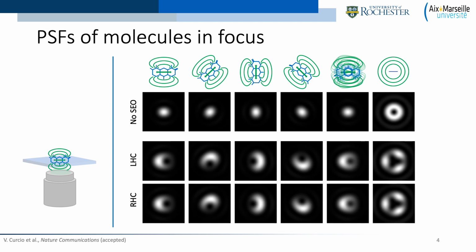Now, just for comparison, in the first row, I'm showing the PSF of a diffraction limited system, so a system that has not been altered, and you can see that our PSF doesn't increase so much in size, roughly twice or thrice. And you can also notice that the PSF alone changes with the orientation of the molecule, but the signature is not as strong, and when you have noise or a lot of background, this becomes problematic.